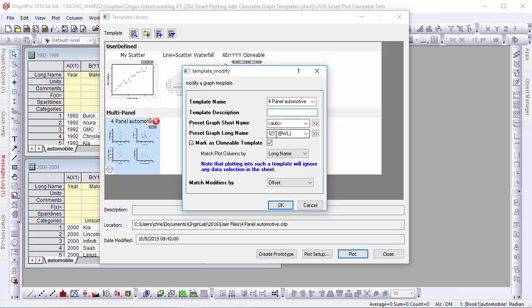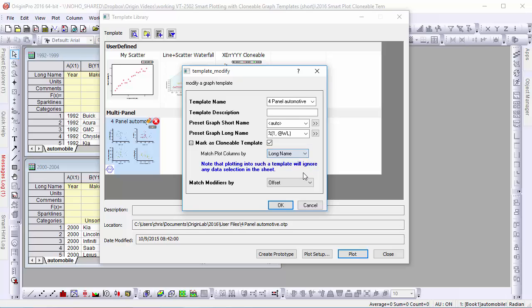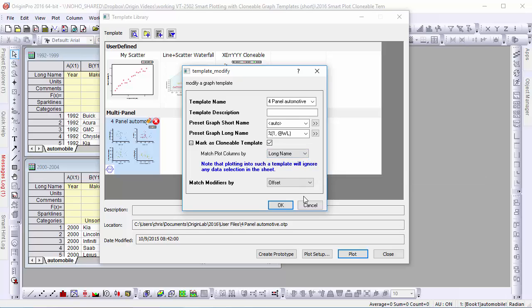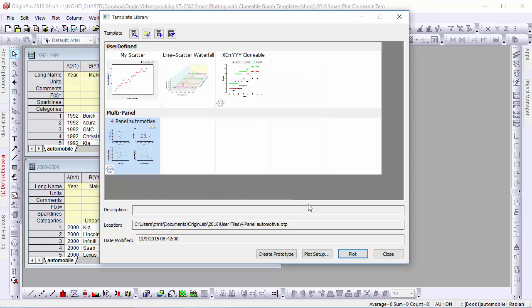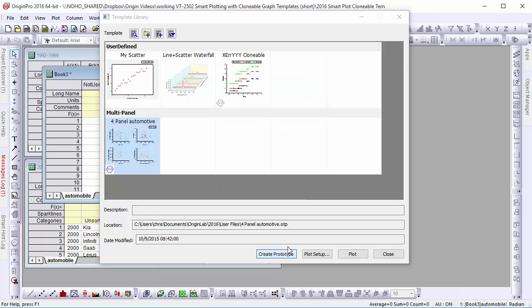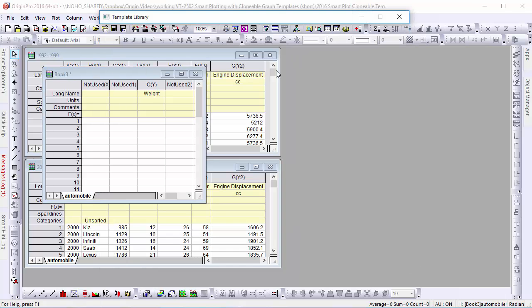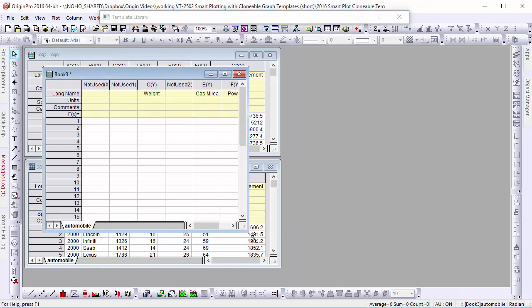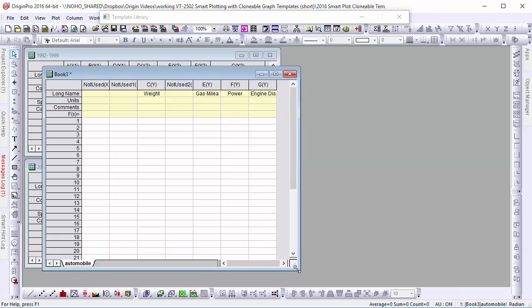And, in the case of Clonable Templates, we can change how the template matches data columns if we find our original choice doesn't work as we wanted. If we click the Create Prototype button, Origin generates a worksheet reflecting the information stored in a Clonable Template, allowing us to see the original data structure.